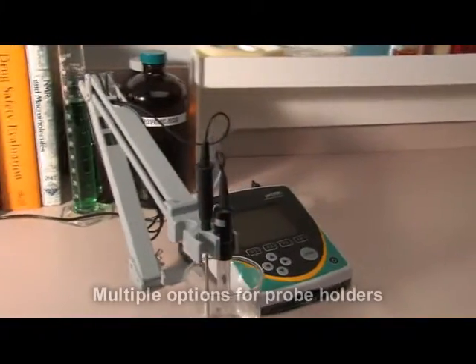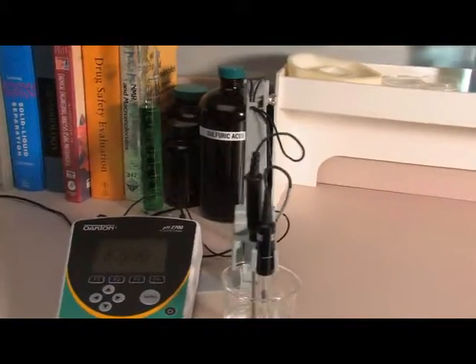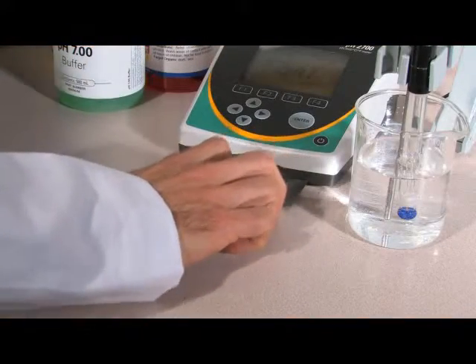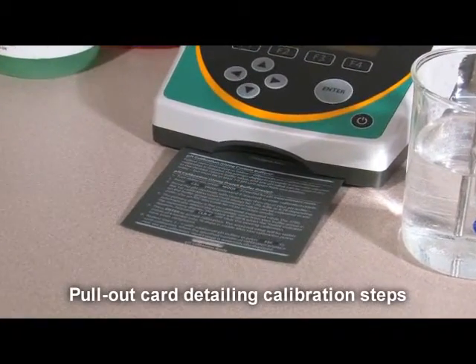Use the probe holder on the left or right side, or even use two probe holders. To make your calibration even easier, a handy pull-out card details each step of how to calibrate your meter.